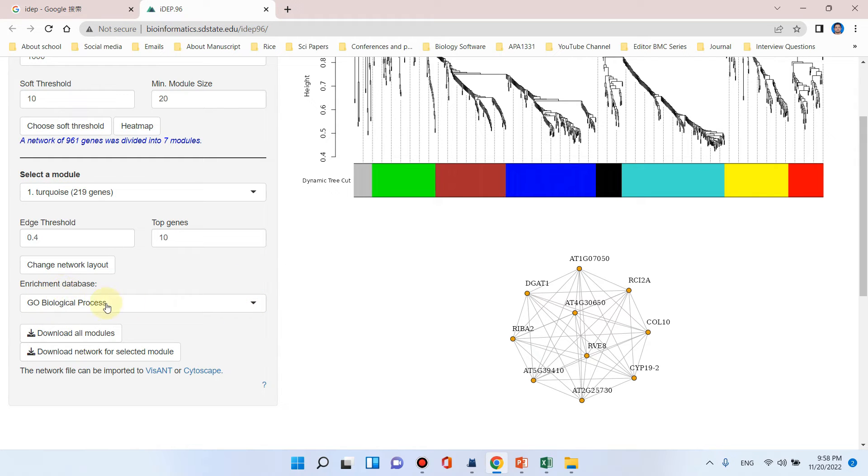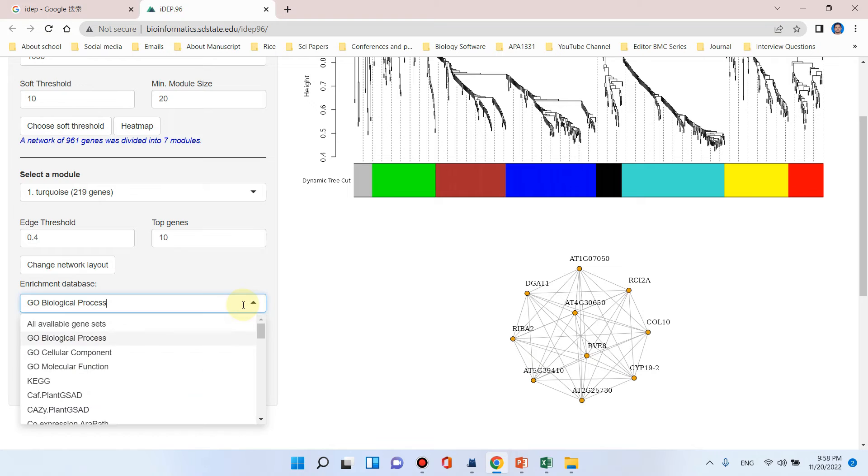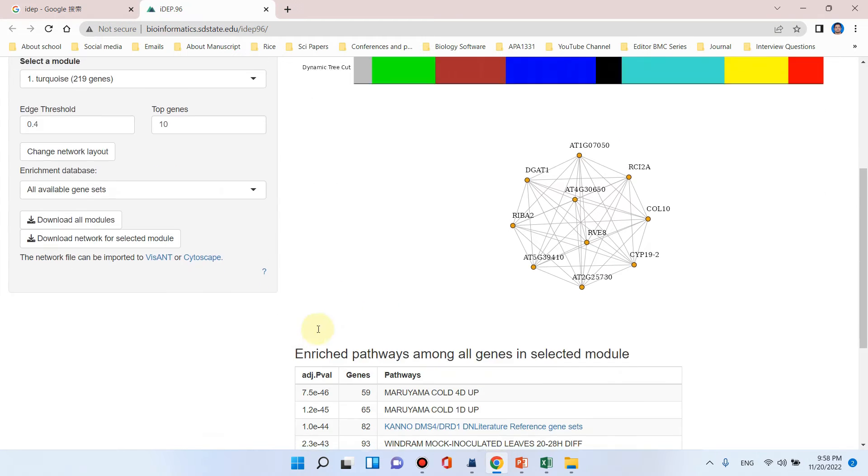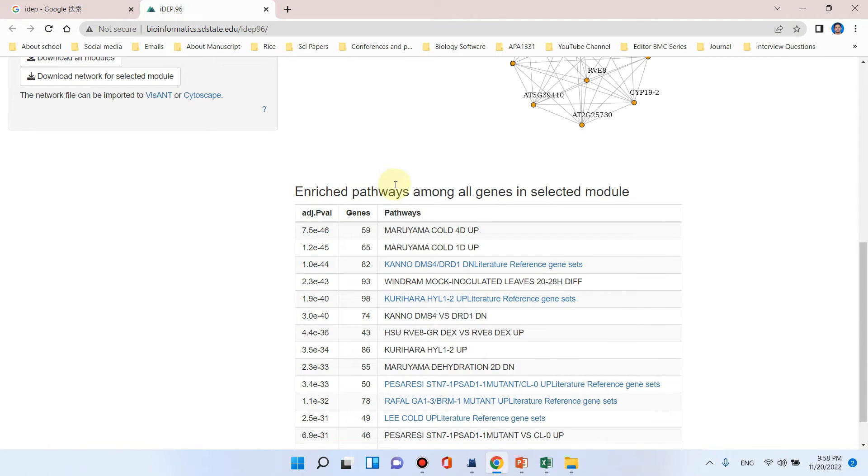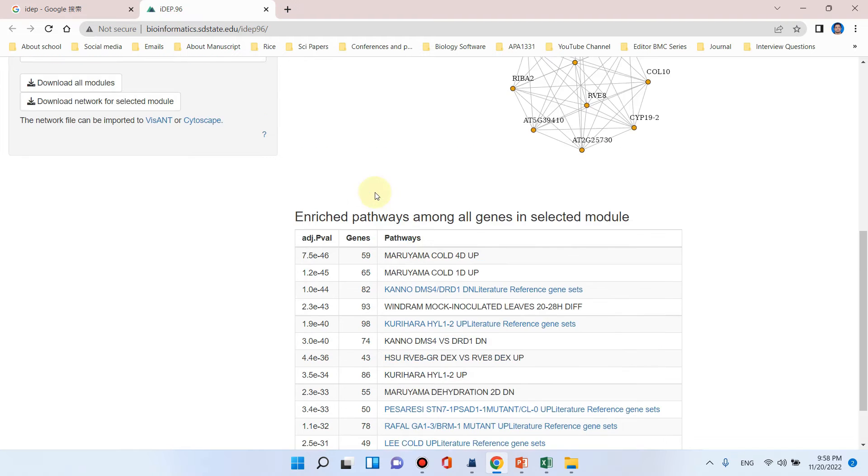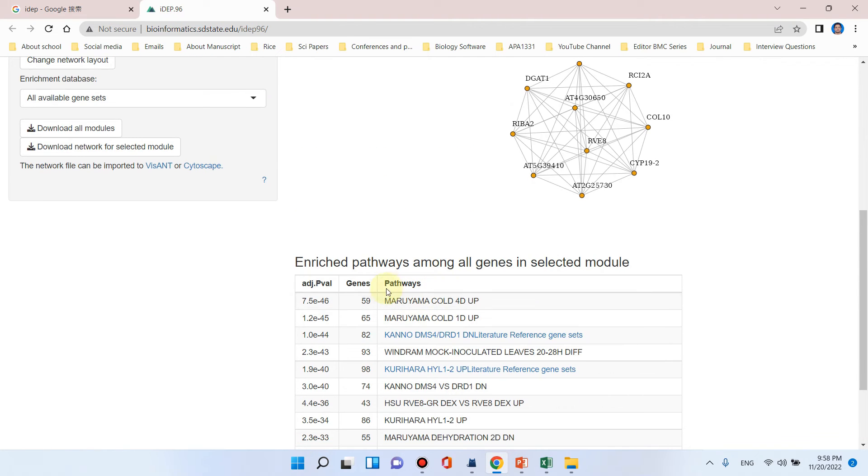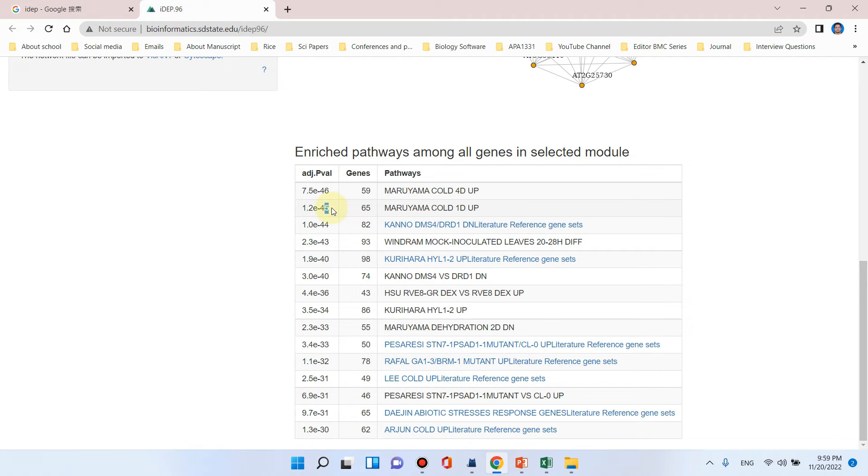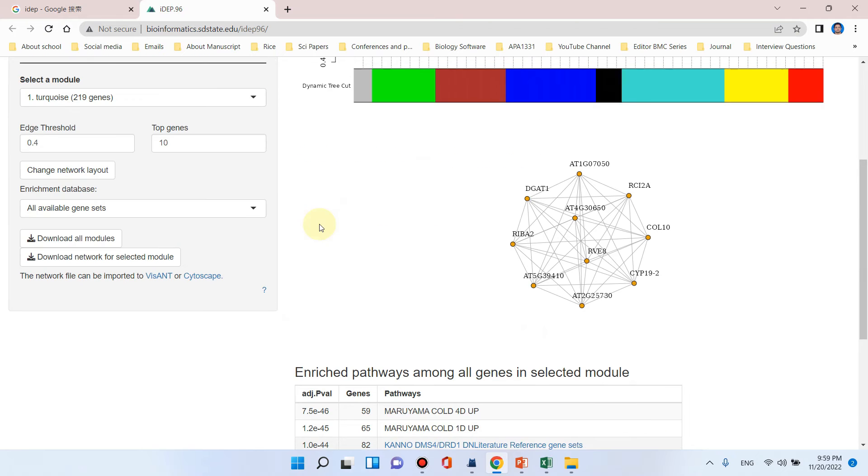The enrichment database they are using is GO biological processes. From here you can select all available gene datasets. Here you can see the most number of enriched pathways among all selected modules. This table is showing the number of genes related to any specific pathway. The adjusted p-value of all these enriched pathways is very high in negative, which shows that all of these pathways are highly significant.